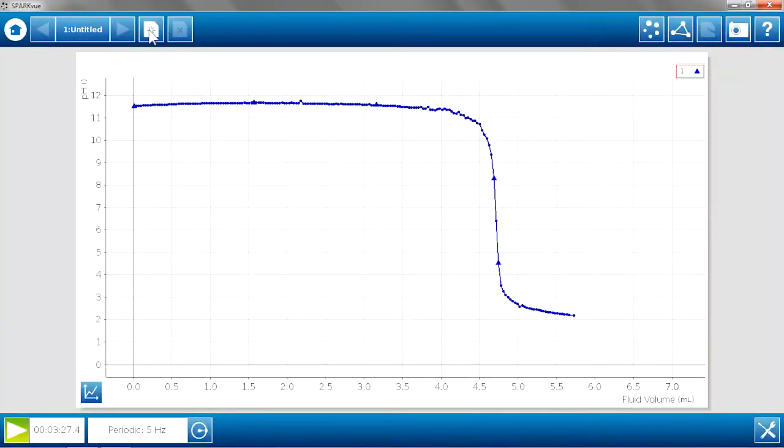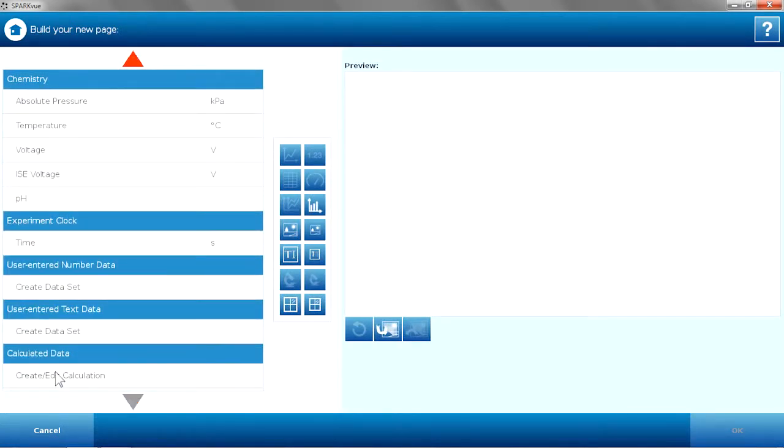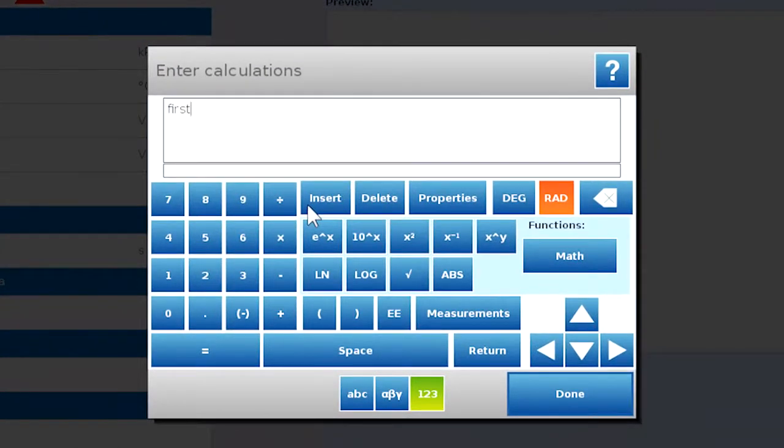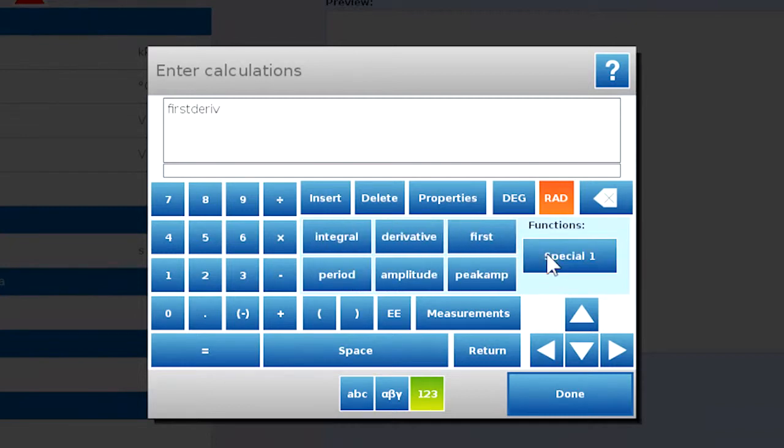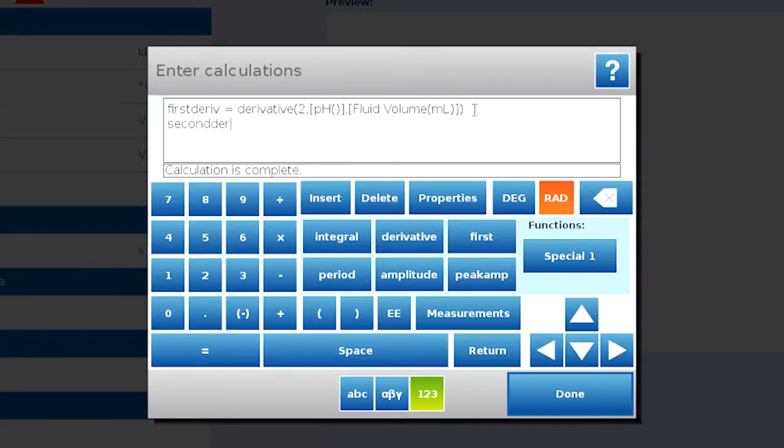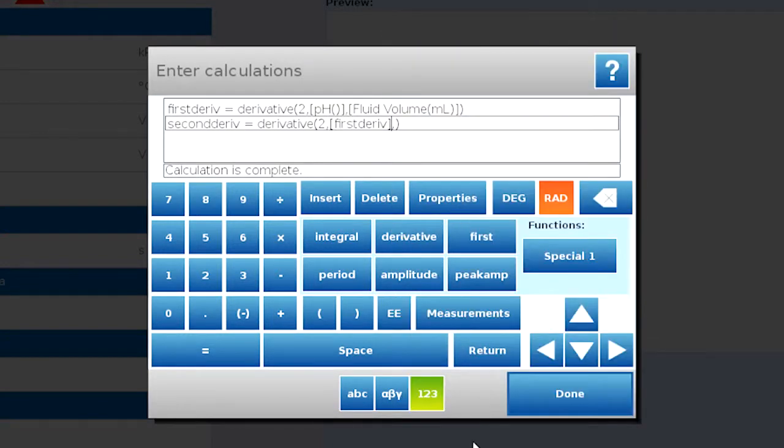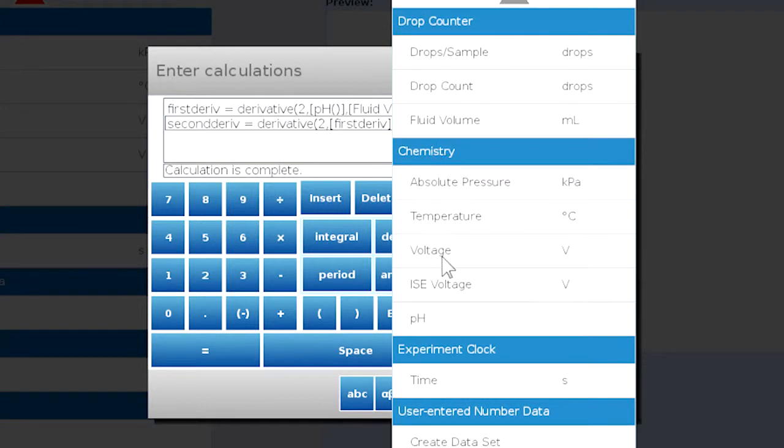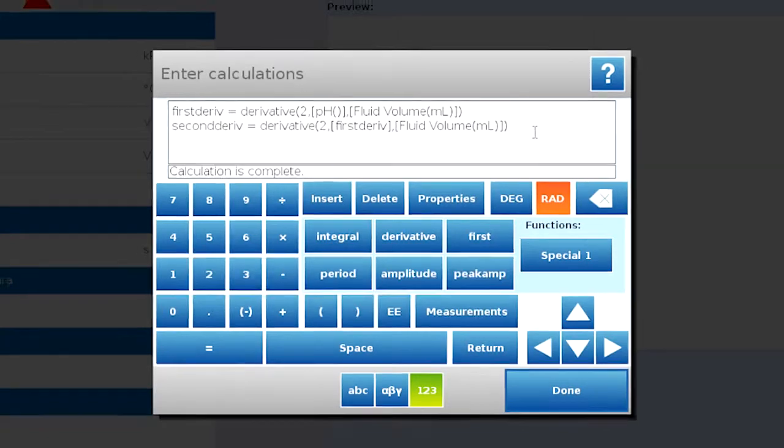We can go further with that. We can use the SparkView tools and our extra measurements to really analyze what's going on in the system. One great way to analyze the titration is to look at the second derivative. So I'm actually going to build a new graph that includes the second derivative of the pH. I'm going to build a page. Go to calculated data. And I'm going to do my first derivative with one of the math functions. And this is going to be a derivative of my measurement of pH versus fluid volume. And those calculations are complete. And now I'm going to do my second derivative. And this is going to be a derivative of that first derivative versus fluid volume. And those calculations are complete. So we'll hit done.